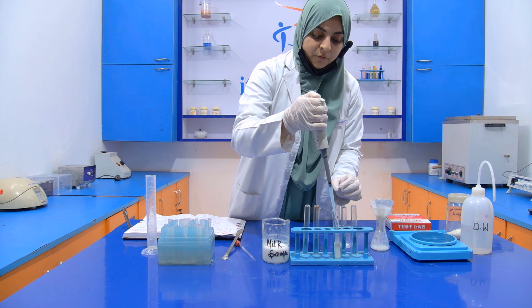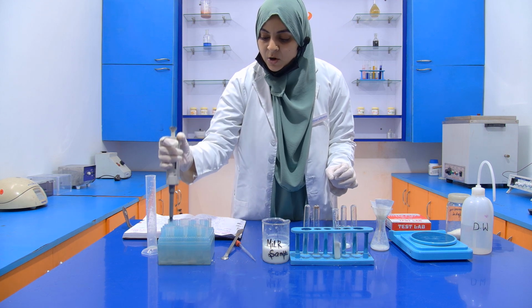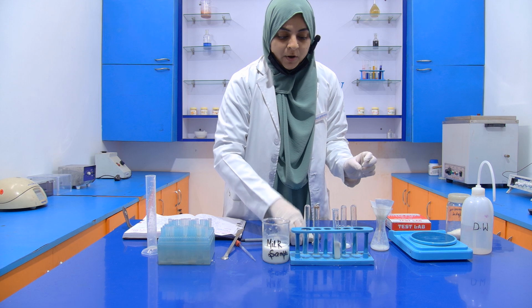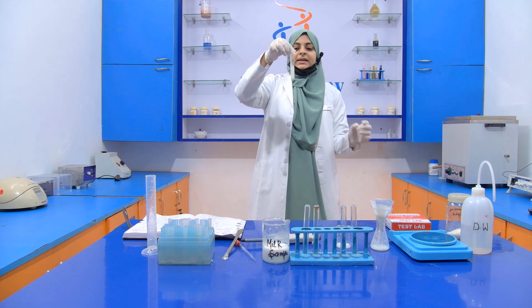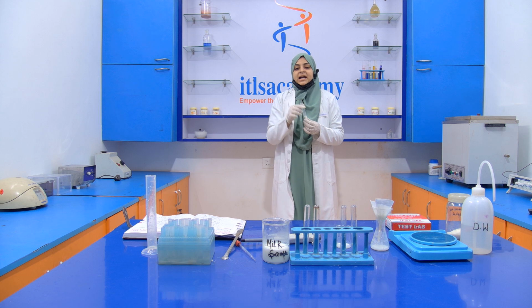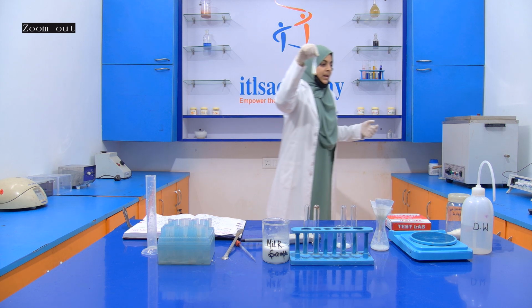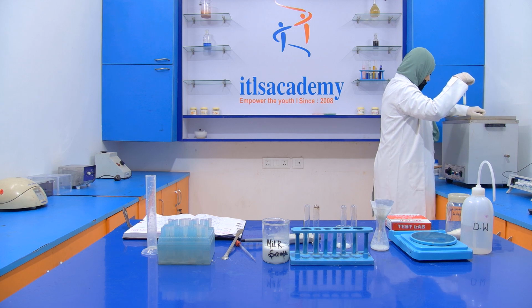Now what we have to do is keep this test tube inside the water bath for 5 minutes at 100 degrees Celsius. If turbidity appears, then it means that proper sterilization did not occur. Okay, let's keep it inside.